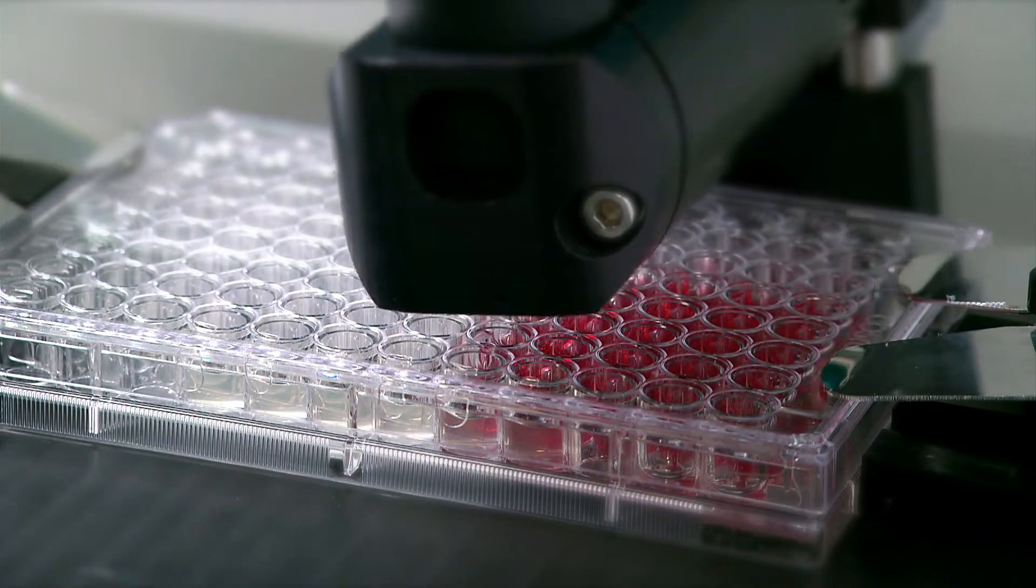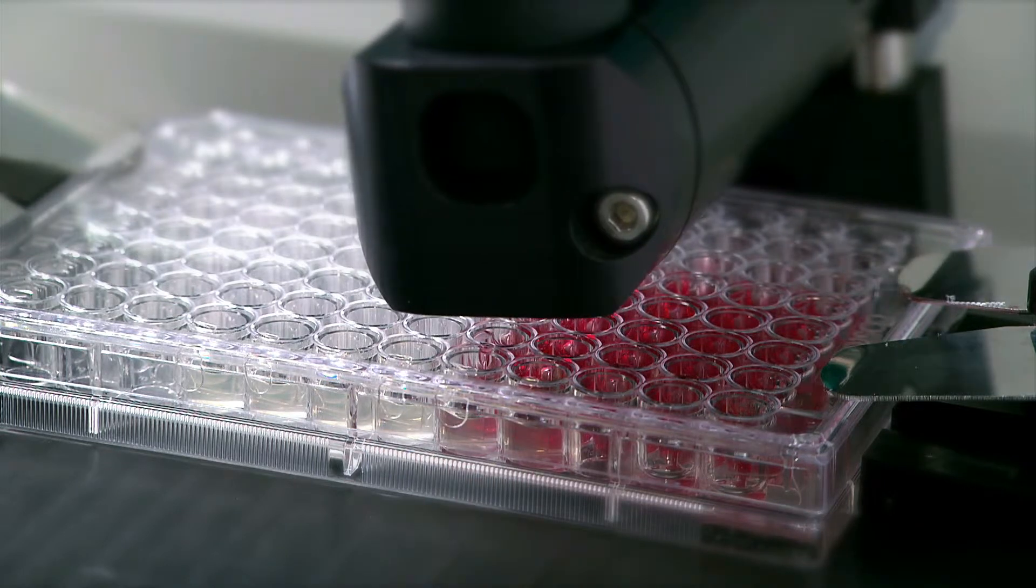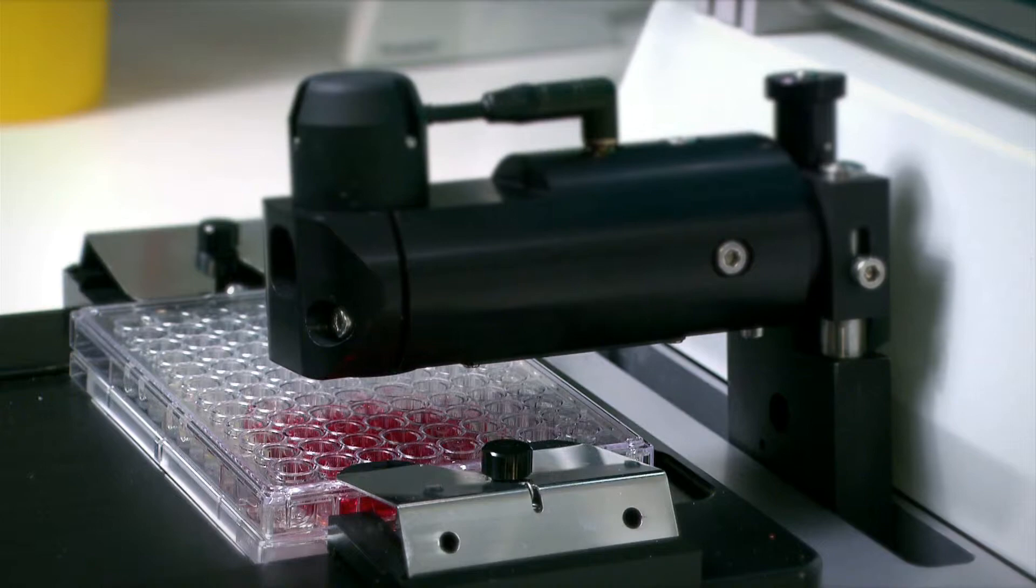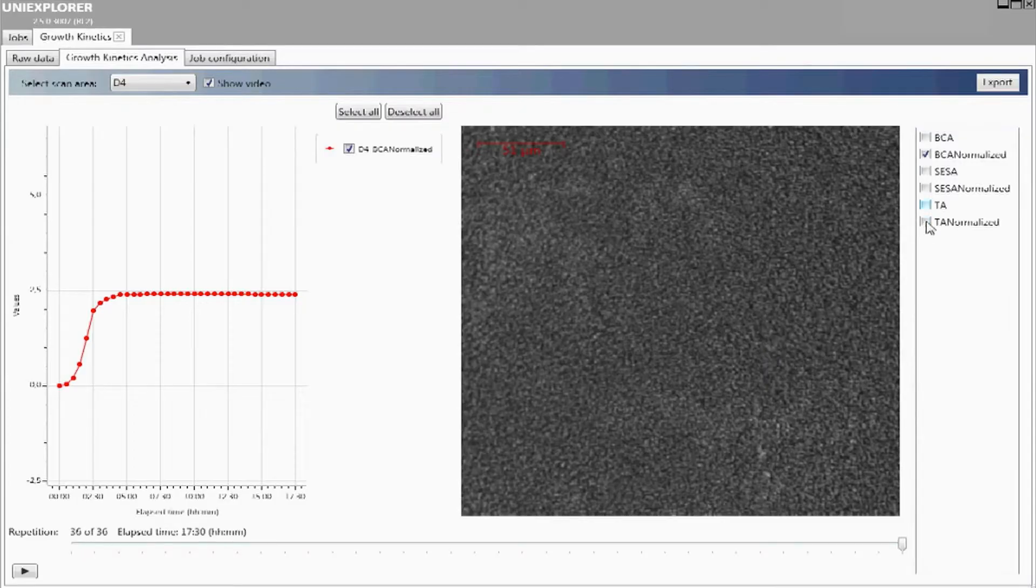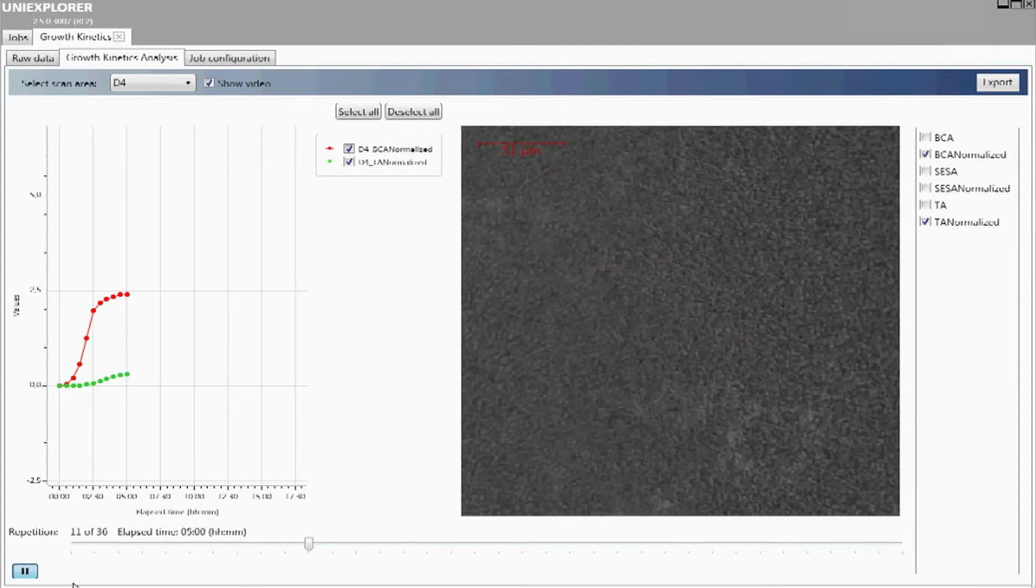Press Start and the Ocelloscope begins its scanning process based on the criteria that have been entered. The cover can be opened if you'd like to follow the scanning process. On screen, you can now follow the graphs produced and see all the pictures that become part of the final film.